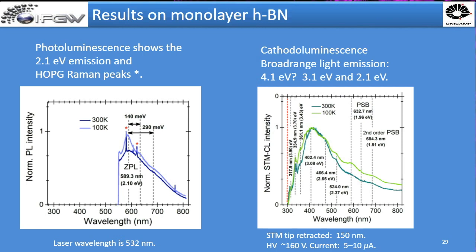So this spectrum has been corrected, and I didn't want to explore the other bits below 300 that were uncorrected. In this particular case, there was no light emission at 6 or 6.1 eV, and we think that is because some of the optical elements that we used were not suitable for this range. So it's a matter of getting the optics optimized for the DUV so that we can reach this wavelength range.